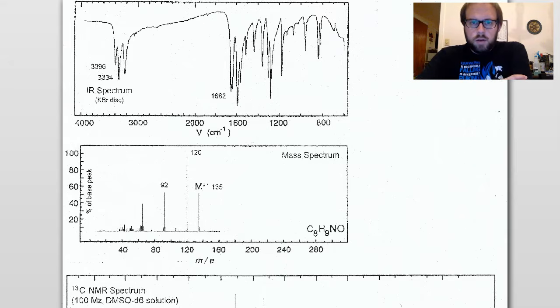Hey everybody, welcome to another Chem Complete episode, and we are doing more spectroscopy today because it seems to be what you guys are really interested in. So, I am going to work on our third unknown that we have here.